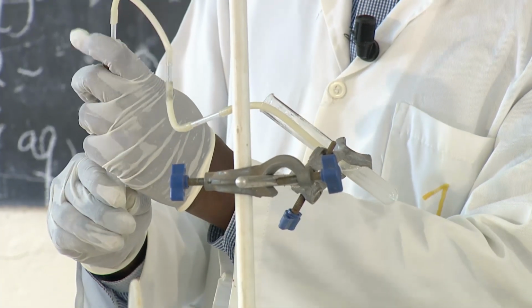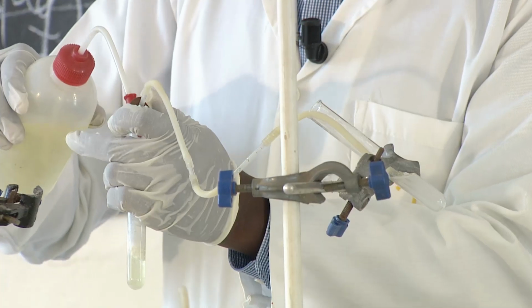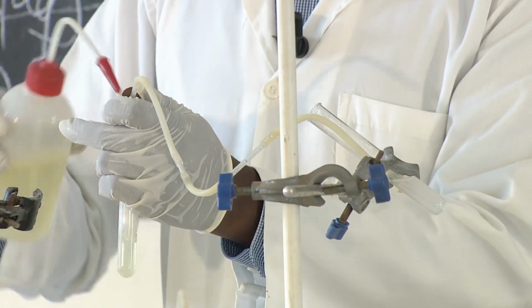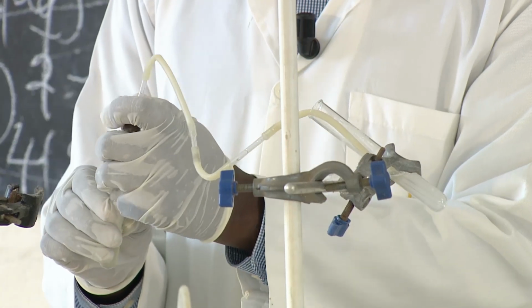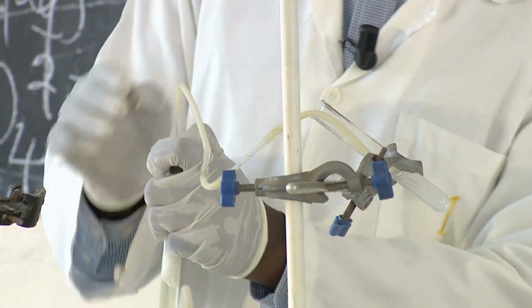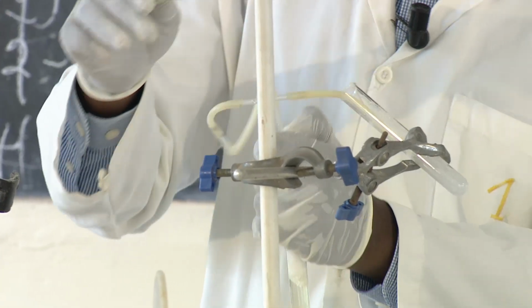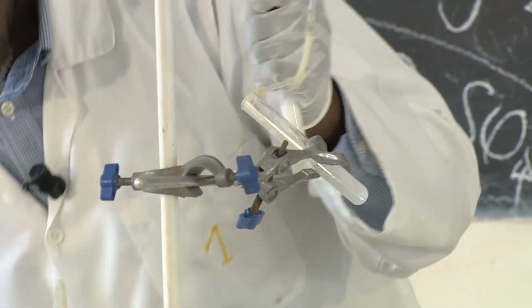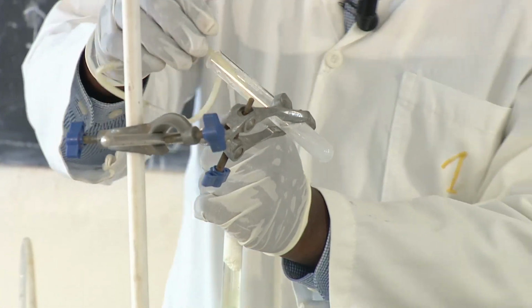It is very important to produce as much carbon dioxide as necessary. So you can just take a look at it, maybe just going slowly.